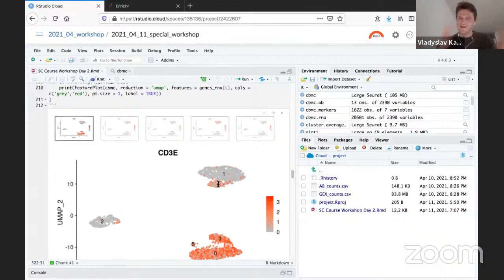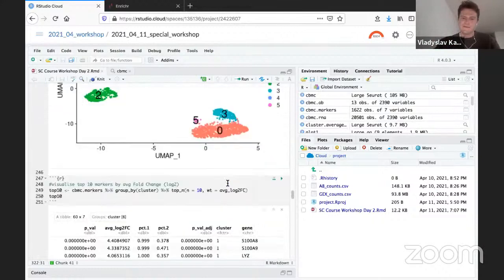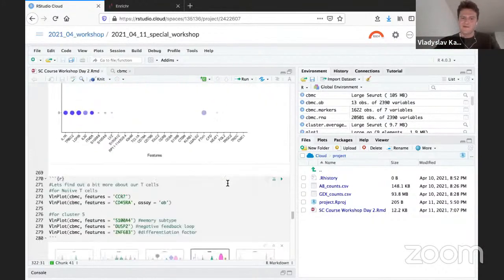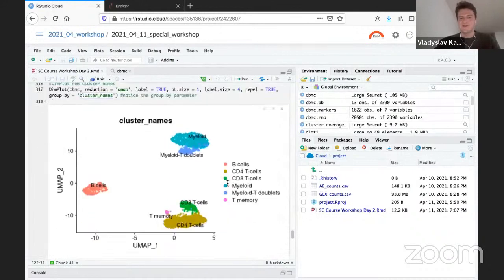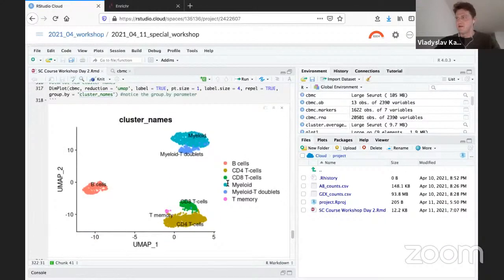So that's why sometimes you can have this doublet information, or a myeloid cell that is eating another cell. And don't be scared. It happens sometimes. It's okay. Just rename your cluster as a doublet or remove it for the further analysis, because when you have a cluster that's combining two such diverse cell types, it can affect your analysis in the future.